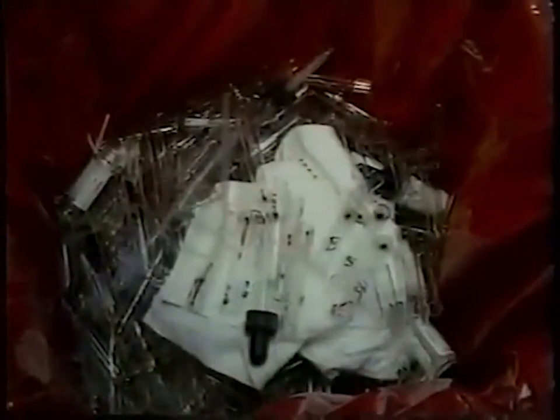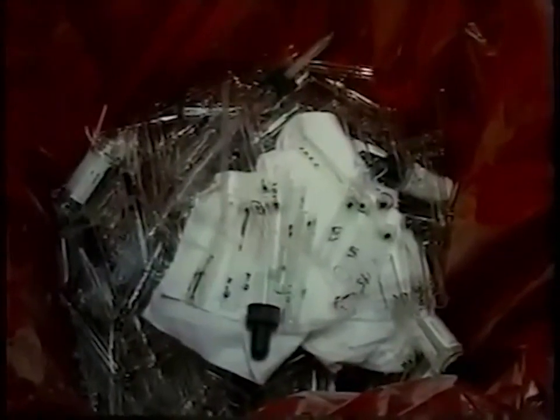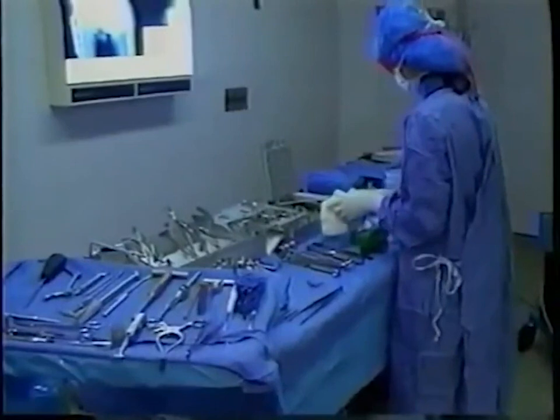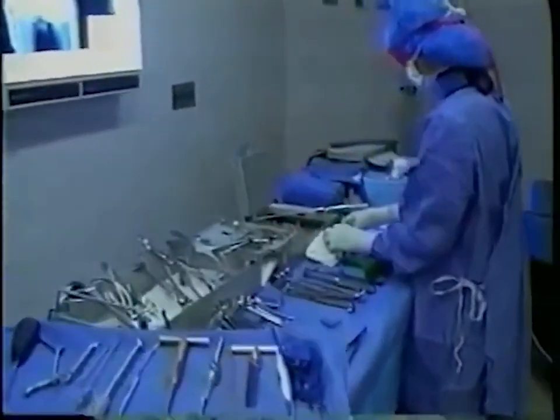Contaminated glass and plasticware that are broken may, at the discretion of the generator, be placed in a double-walled corrugated or solid fiberboard sharps container. However, needles and scalpel blades are prohibited from being placed directly into double-walled corrugated or solid fiberboard sharps containers.